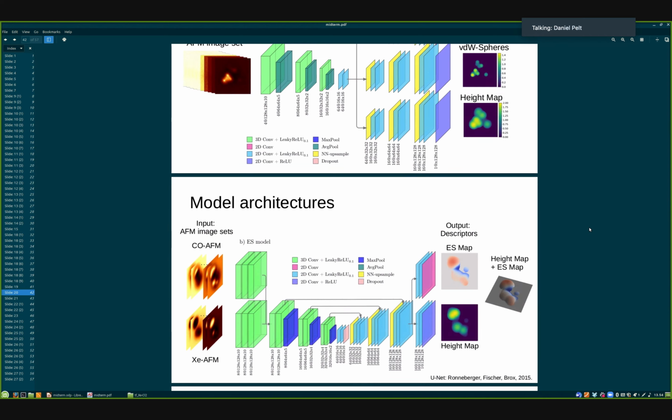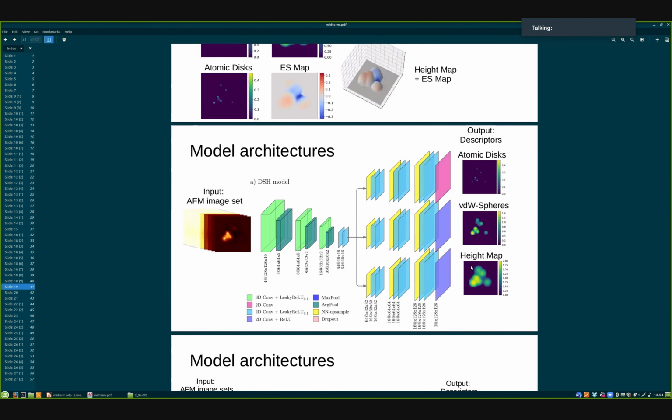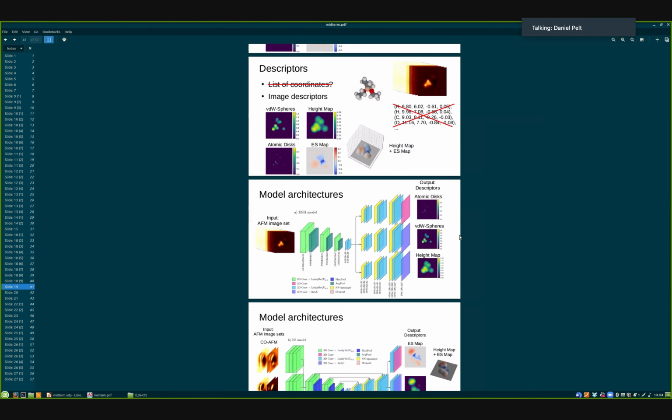Then to a much bigger question. One thing I am missing from the presentation, and also in the report, is what you used as training data. What did you train on? What kind of images were they, and from what molecules? This is a more generic comment: especially for these machine learning based methods, it is becoming more and more important to state these very clearly and correctly, because with all this machine learning, the training data becomes part of your method as well.